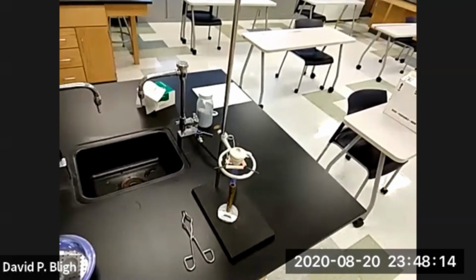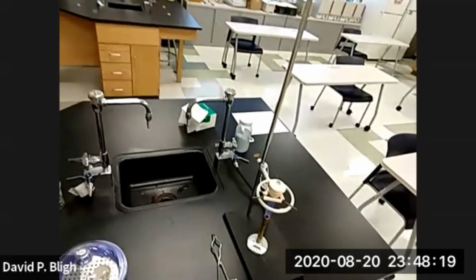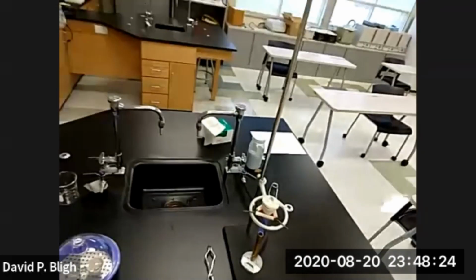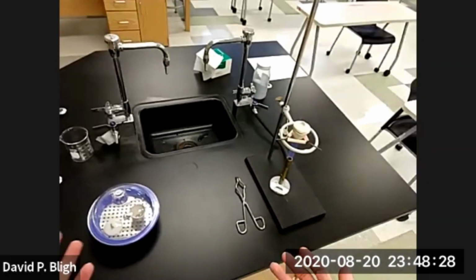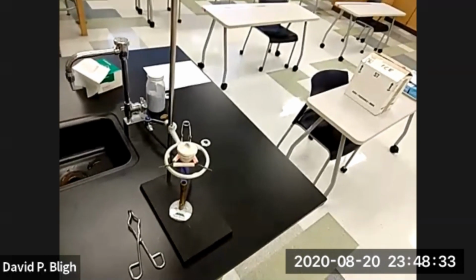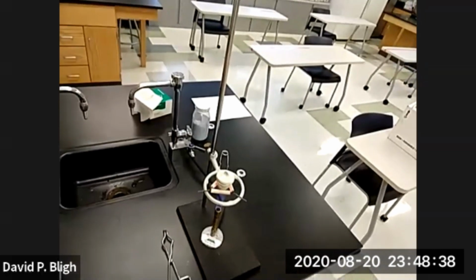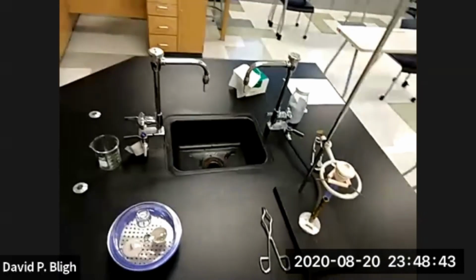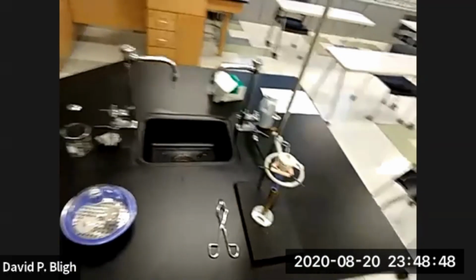But there are very few things that can stand that heat. So what we'll very often do is we'll take an etcher, either a diamond stylus or a carbide stylus, either stationary or vibrating, and just etch a number on both the crucible and its lid. And there'll be a matching pair, and you can keep track of them that way. But since we've only got two, I think we can keep them safely apart and know which one's which.